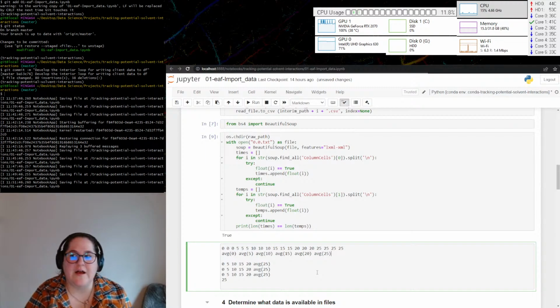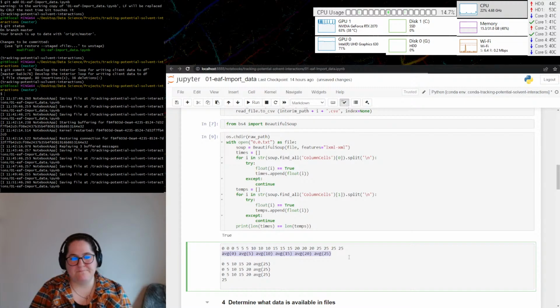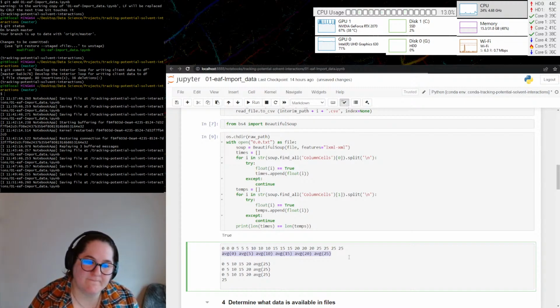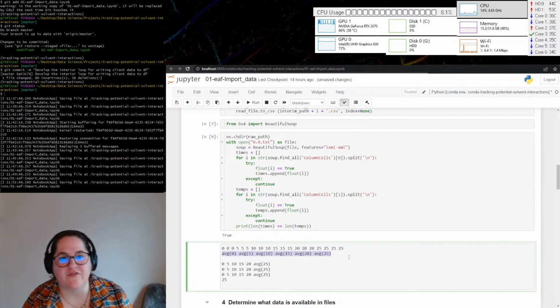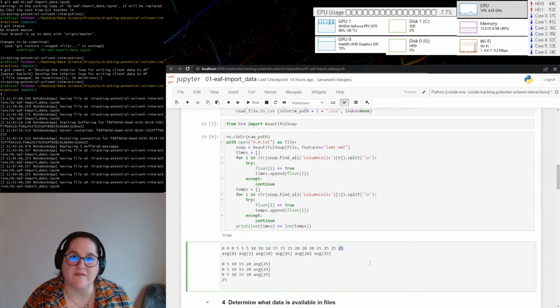Now, I know whenever I initially studied this data, I went to this average route. To try to figure out the shape, the pattern of my standard curve to see if it was linear or if it was exponential, kind of what was going on with it. And I have to remember that embedded in each of these trials are those 2 columns of time and temperature. So I have to figure out kind of how I want to evaluate that temperature and what I want to do with this 25 data.